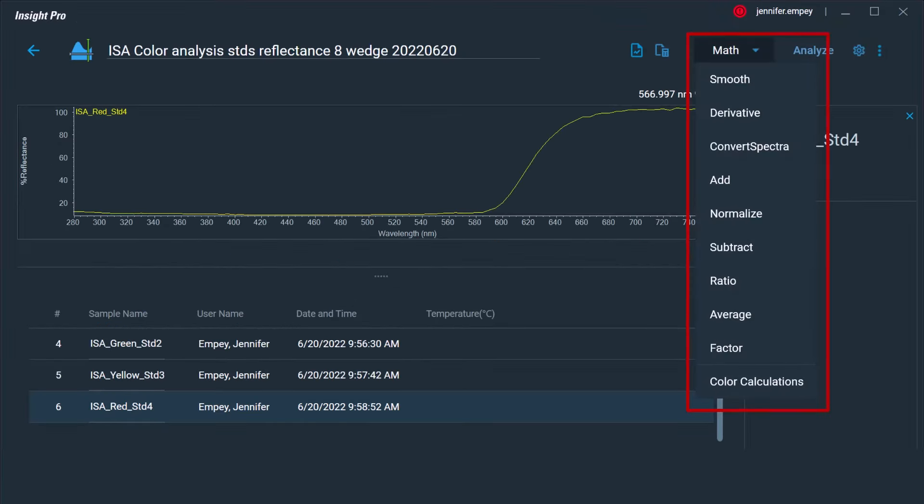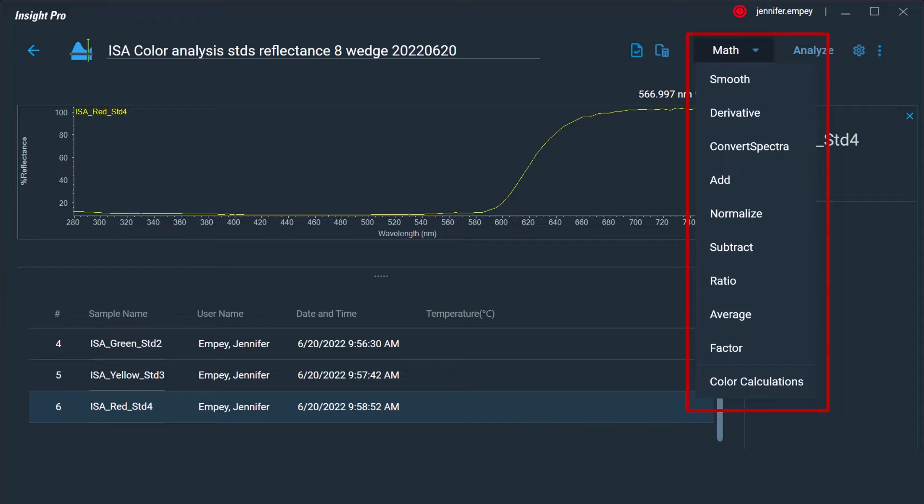After the spectra are collected, there are several unique features which can be used to analyze the measured data. For example, the math functionality includes a list of mathematical functions which can be applied both to a single spectrum, such as taking a derivative or normalizing the spectrum, as well as between multiple spectra, including adding or subtracting spectra from one another.